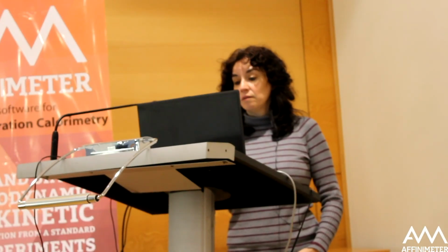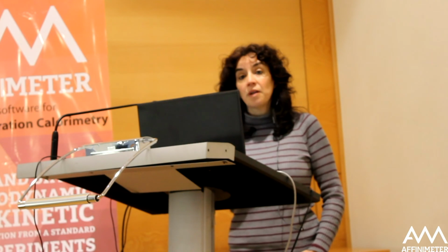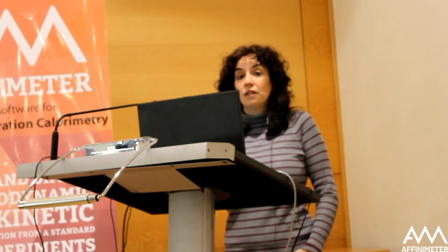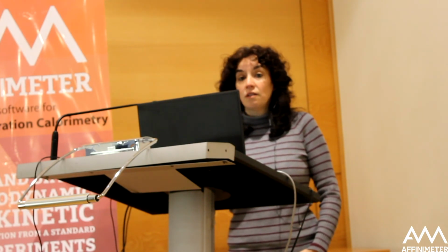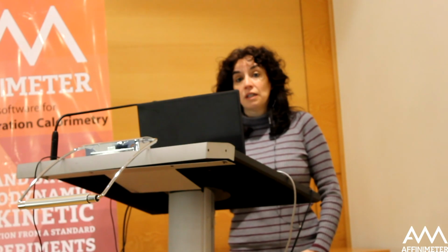So this would be the tutorial of KinITC. You have more information on our website. If you go to the Affinimeter website, there you will find nice written tutorials also of how to use KinITC.